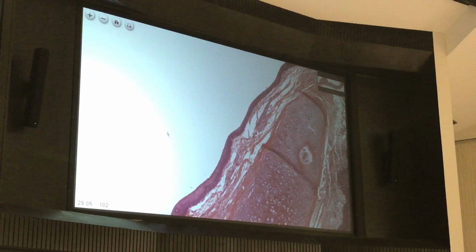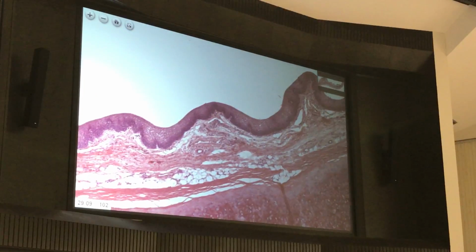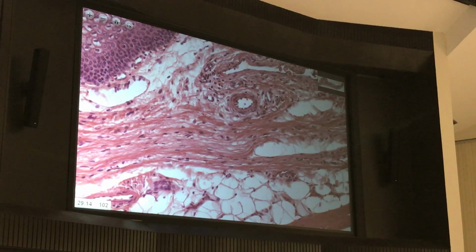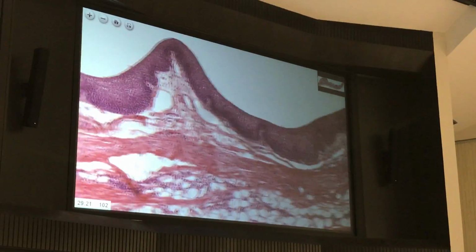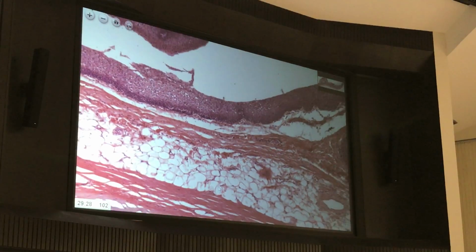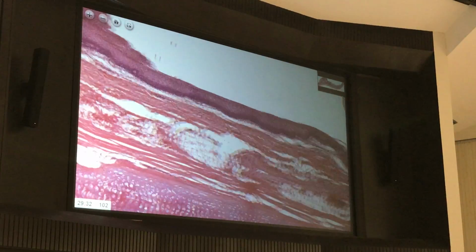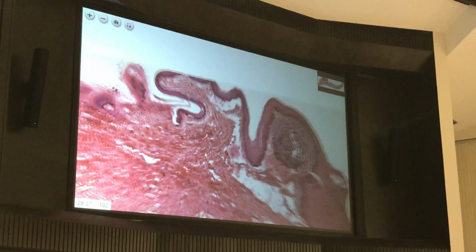Because remember, these are all exocrine or endocrine ducts that we're looking at. Exocrine, right? What would this be? A duct? No. A little blood vessel. It's a little arterial. There'll be one here. Blood vessel. There should be something here. All those would be different.